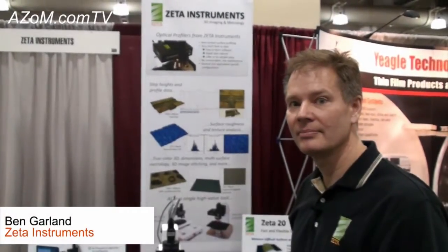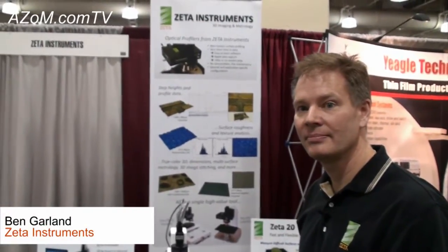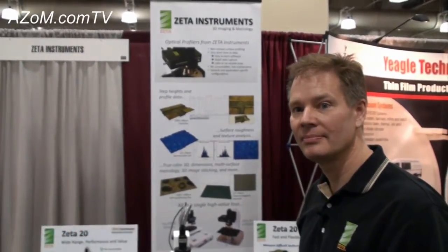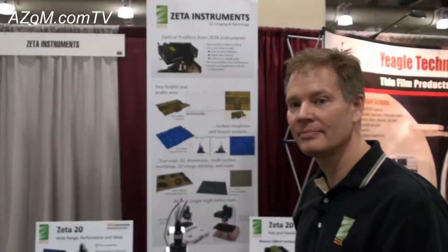This is Cameron Chai from azom.com bringing to you another episode of azom.com TV. Today I'm speaking to Ben Garland from Zeta Instruments and he's going to tell us about their Zeta 20 optical profilometer.